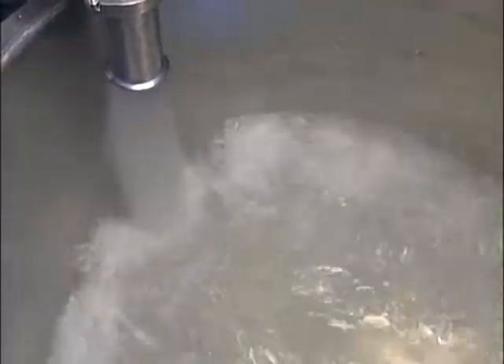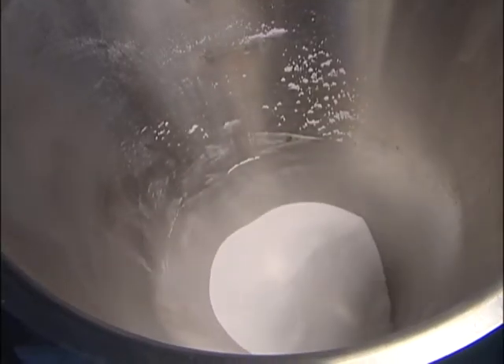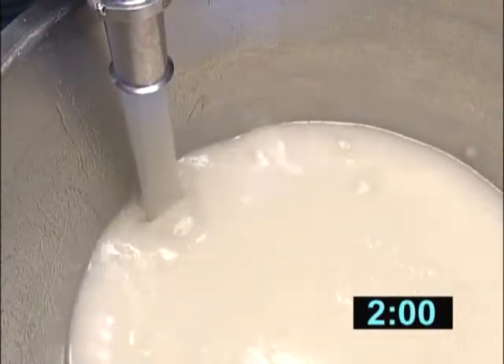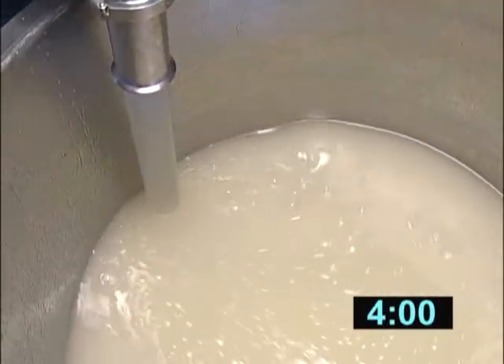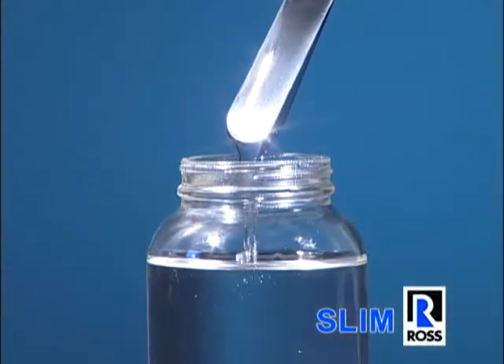In this example, a powdered thickening agent is charged into water. After the powder addition, the mixer continues to run to finalize the hydration of the thickener. After a few minutes, the material has gained significant viscosity and the finished product is a clear gel free of undispersed powders.